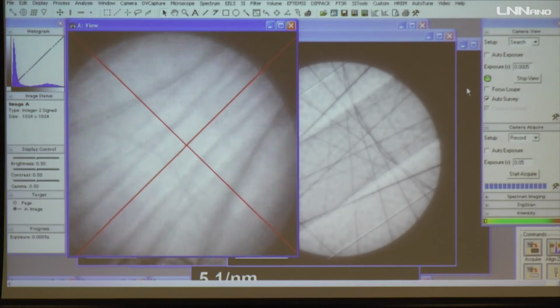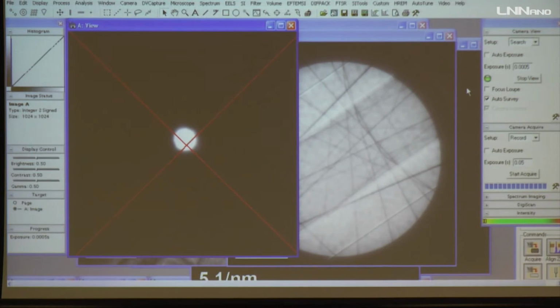So here, in this orientation, I focus the beam exactly on the sample. Now I change the height. Just increase the height. Okay, so I increased the height a small bit.